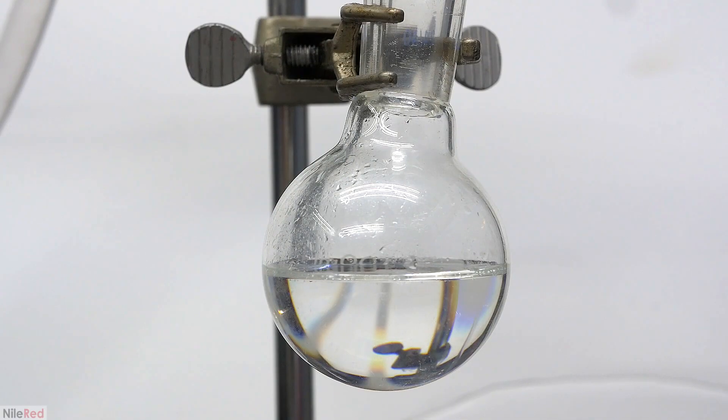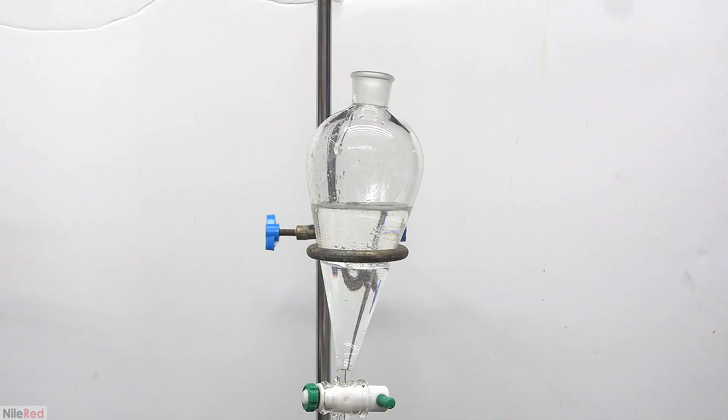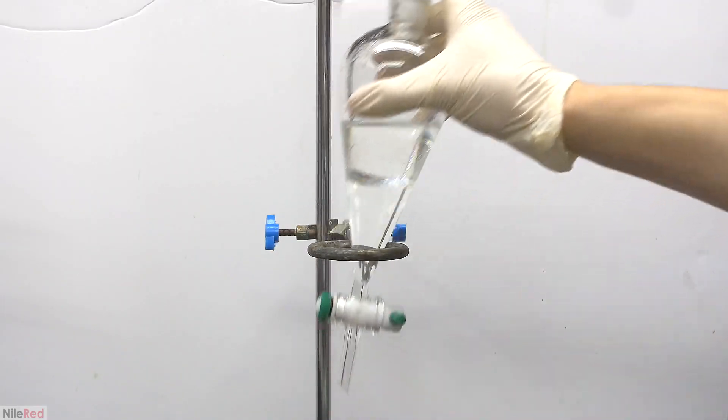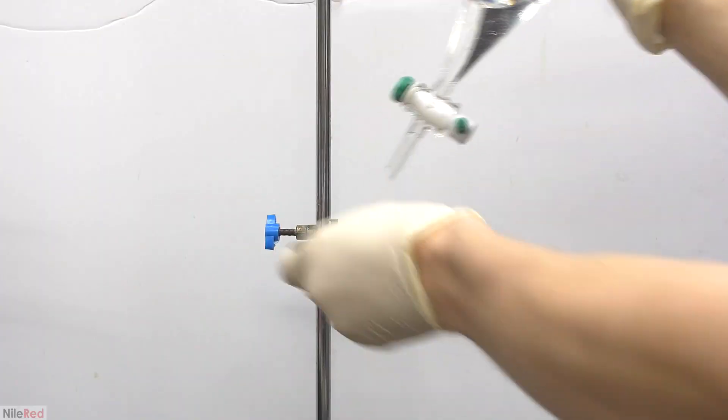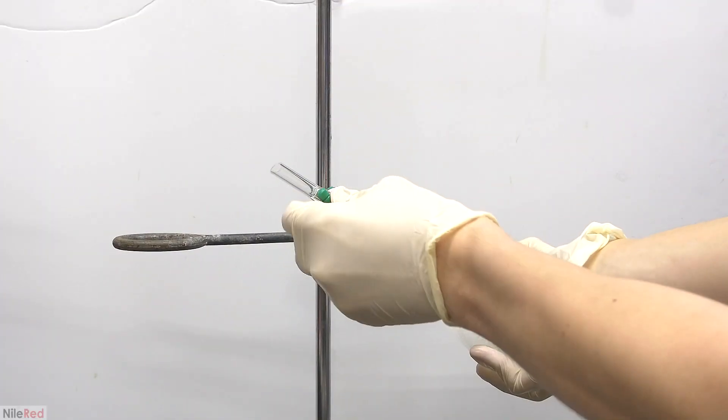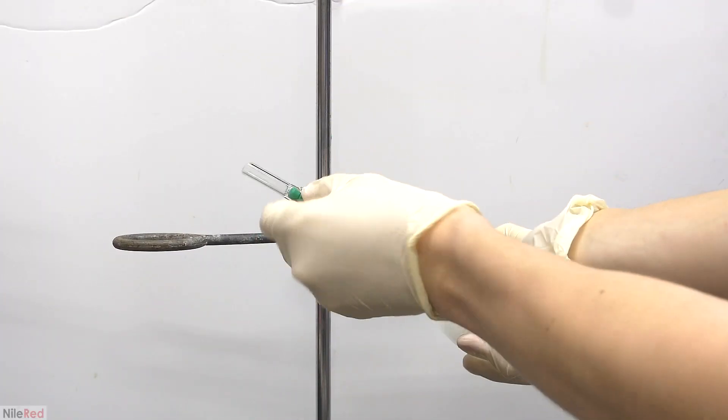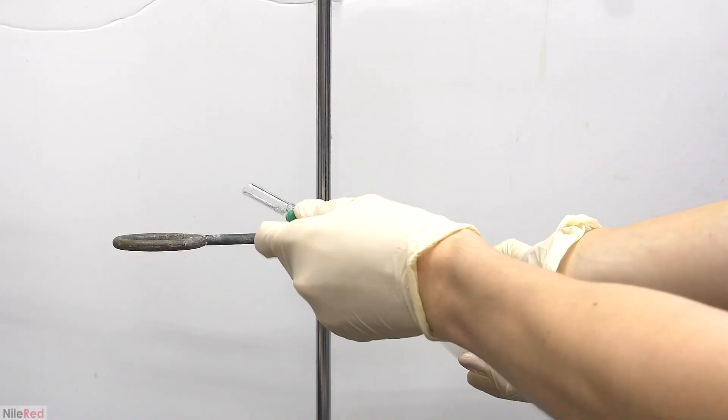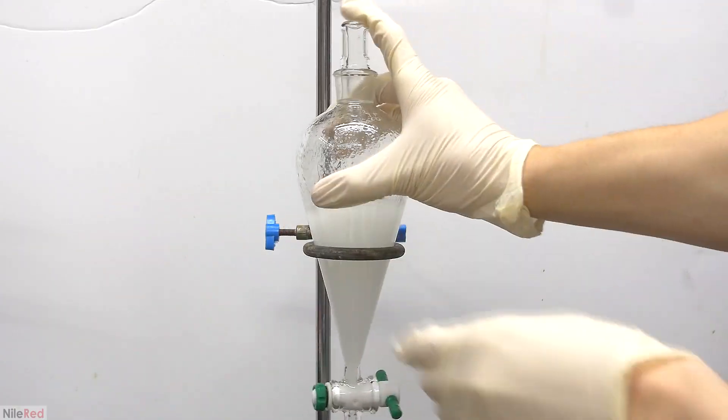But a major downside is that it might be really hard to get the oil depending on where you live. I know that at least in the US, it's illegal to import bitter almond oil. This law is in place for pretty much the exact reason why we want it, because it's pretty much just pure benzaldehyde. Although I only use benzaldehyde legally, some people do use it as a drug precursor.